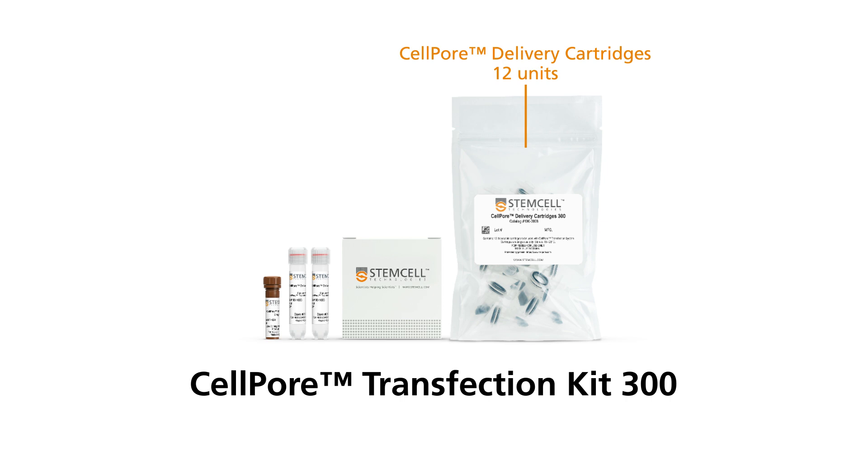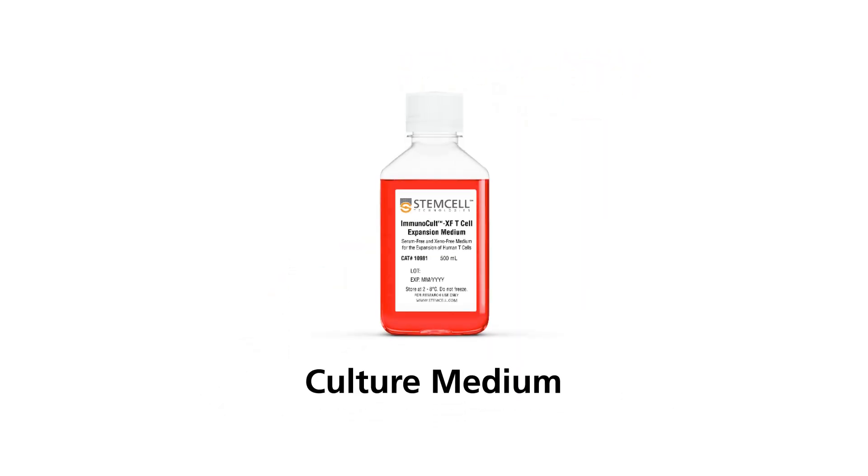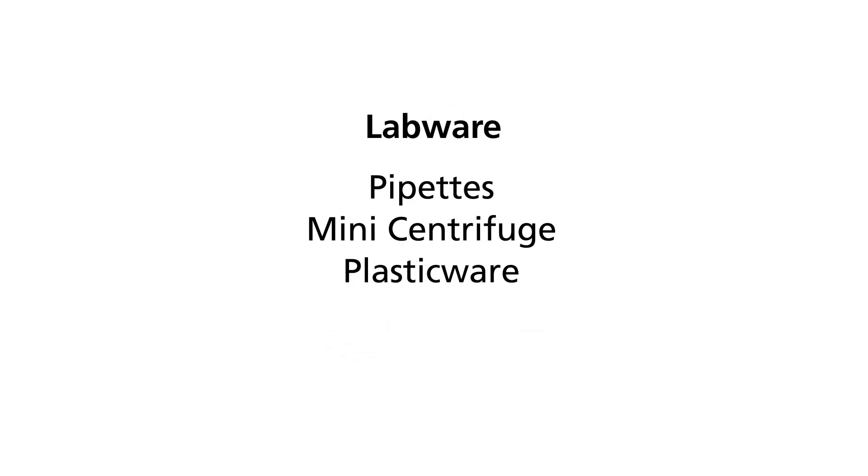Each cartridge comes pre-assembled in its collection tube. The appropriate cell culture medium. Appropriate labware including pipettes, a mini centrifuge, plasticware, and cultureware.